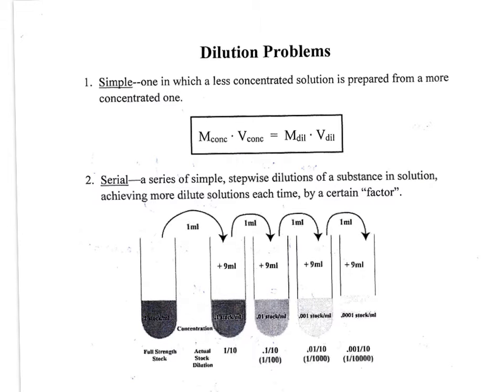This week in lab, you're going to do an experiment that involves preparing a solution. What you're going to do is take a stock solution that will be provided to you, and dilute it down so that you end up getting different concentrations. The starting or stock solution they're going to give you will be of a certain molarity. So remember what molarity stands for: moles of the solute per liter of solution.